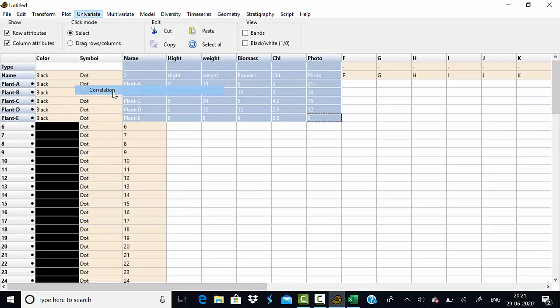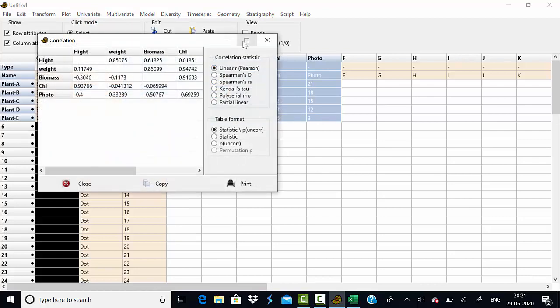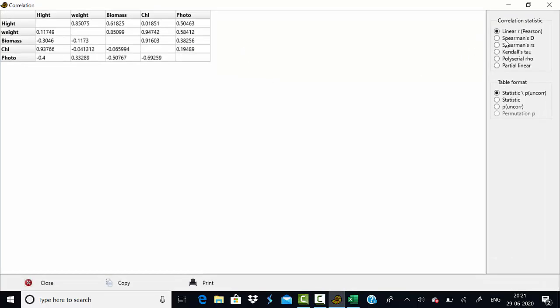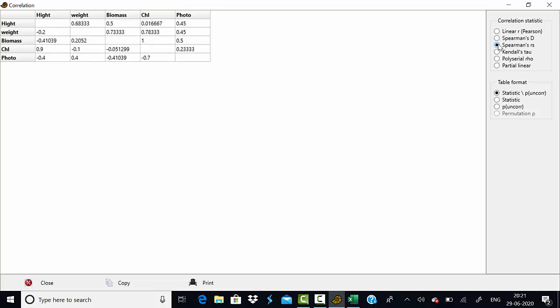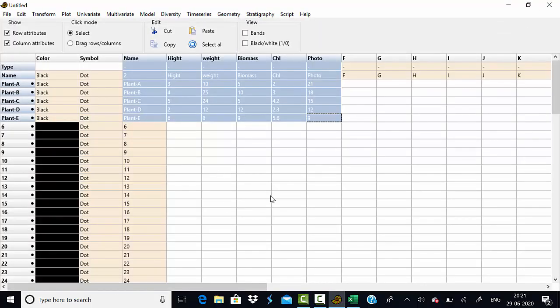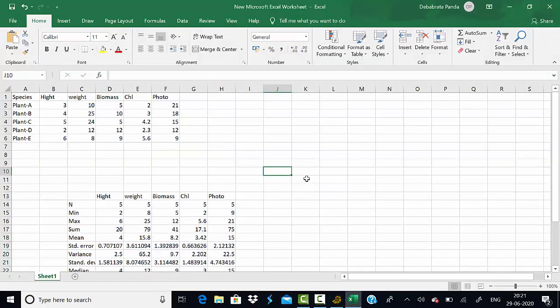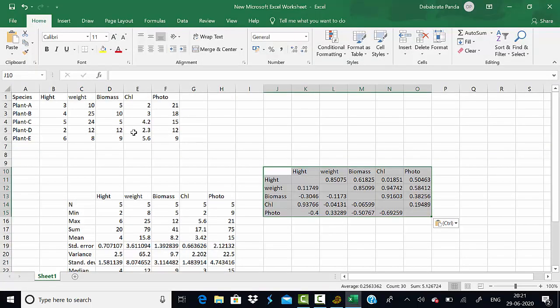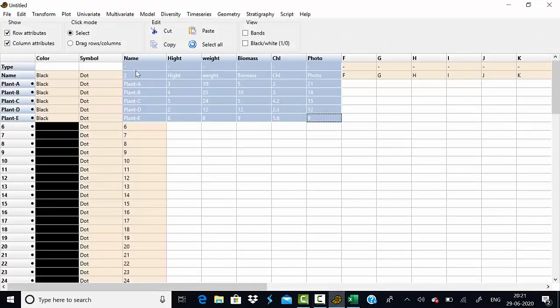Under univariate analysis, we can also calculate correlation very easily. There are different types of correlation available, including Pearson's linear correlation and Spearman's correlation. These results can also be copied and pasted into an Excel file, making it very easy to extract the data.